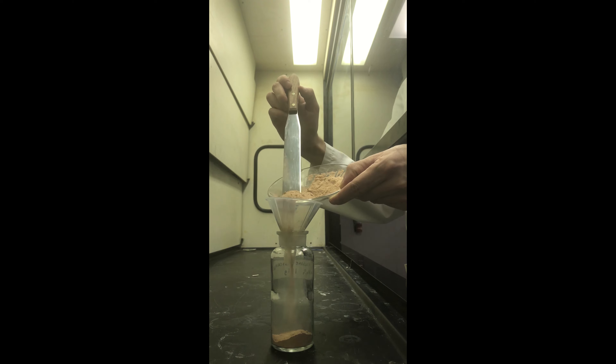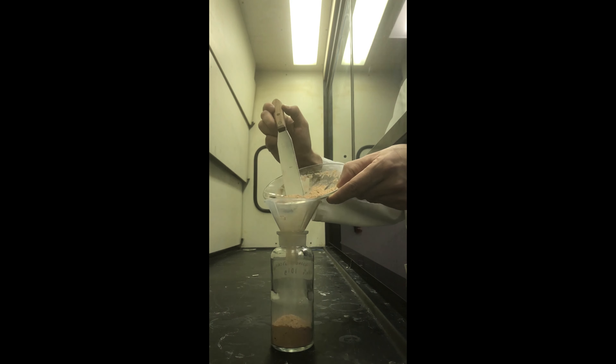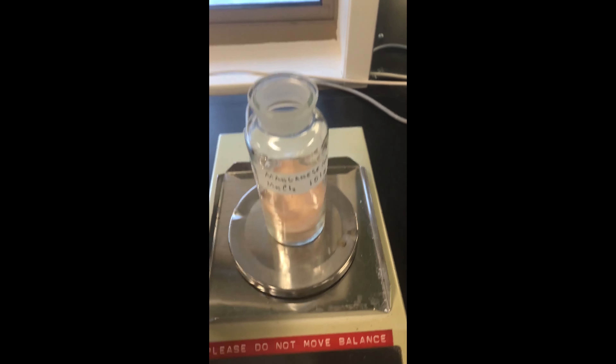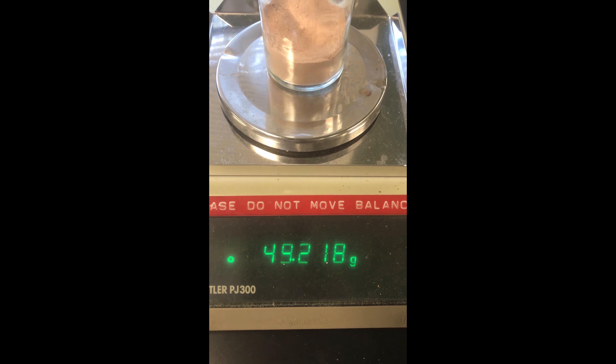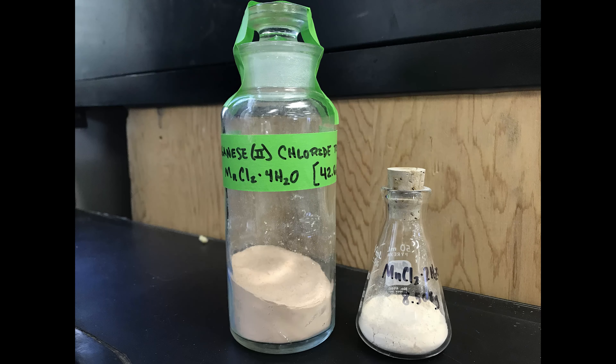What I wound up doing after this — and I didn't film it — was titrating the two different samples of manganese chloride I came up with after continued rigorous purification. I spent way too many hours just trying to clean this stuff up. It was a precipitometric titration, dissolving them in water and titrating with a known concentration of sodium hydroxide, then doing math based on the endpoint. The second material I produced was approximately 99% pure manganese chloride tetrahydrate, and the first sample, after many more purification steps, was about 99% manganese chloride dihydrate.